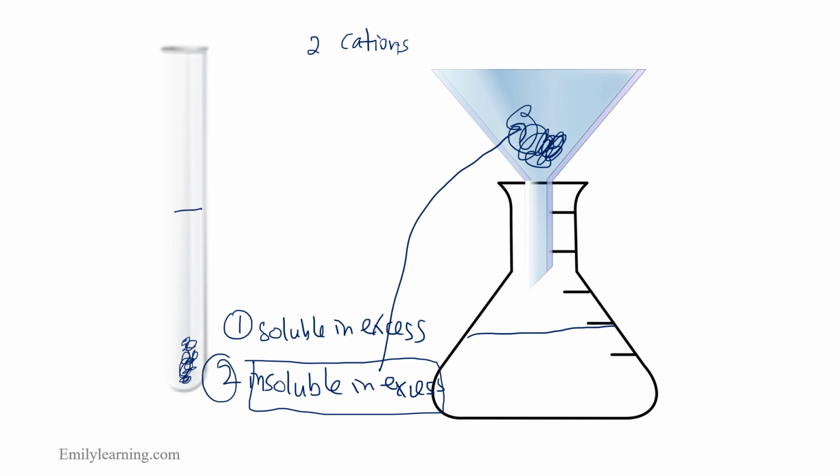Next, there is another cation that is soluble in excess. So next we can determine what cation this is by looking back at your QA cations table to determine the cation based on the color of the solution. So if you have a colorless solution when the PPT is soluble in excess, for example NaOH, to give a colorless solution, based on the QA table we know that it is either aluminum ions or zinc ions. So based on this, you can look back at the QA table.